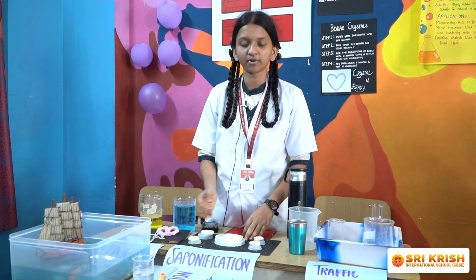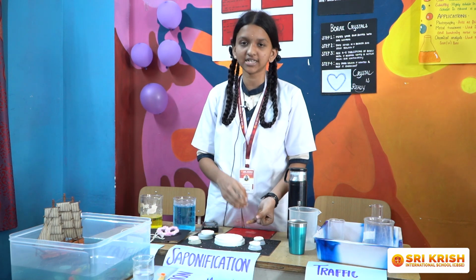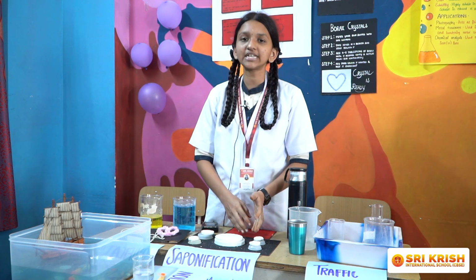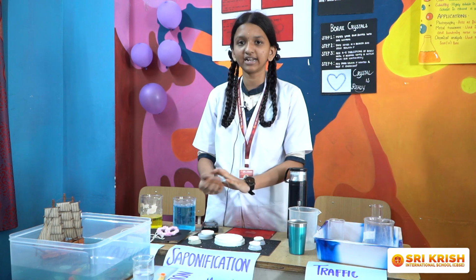Saponification is nothing but the process of soap making. So the required materials for this experiment are NaOH, that is sodium hydroxide, coconut oil, and NaCl. First take sodium hydroxide and water in a beaker and take NaCl and water in another beaker.